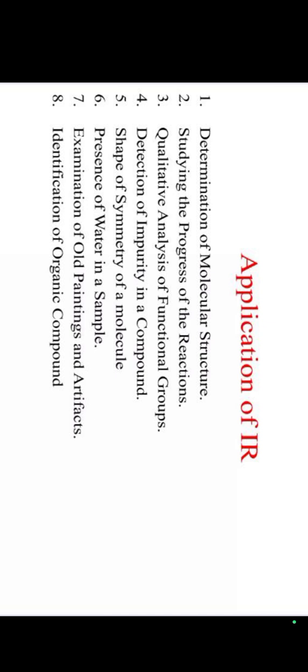Next one, seventh type, examination of old paintings and artifacts. To examine old paints and artifacts. Eighth, identification of organic compounds. A new organic compound can be identified, and the molecular structure will be determined, and the functional group also identified. These are the applications of the infrared radiation spectrophotometer.